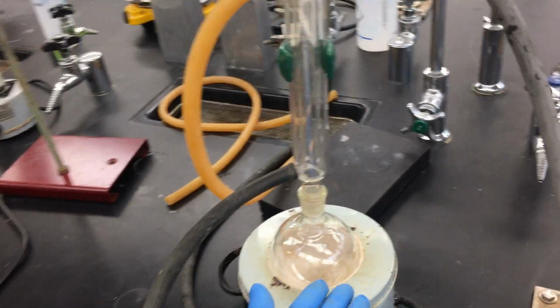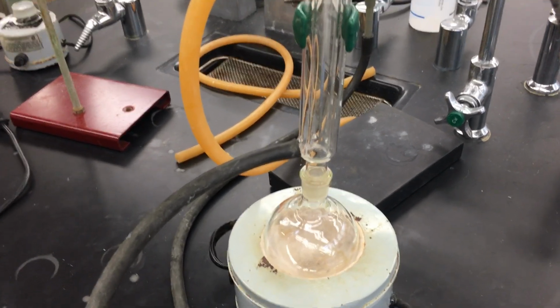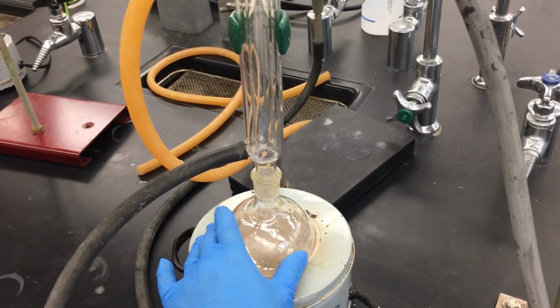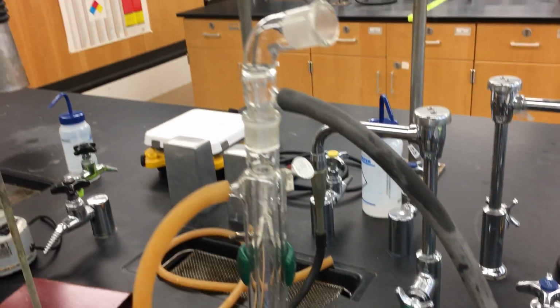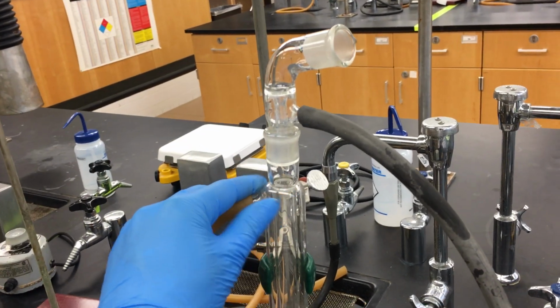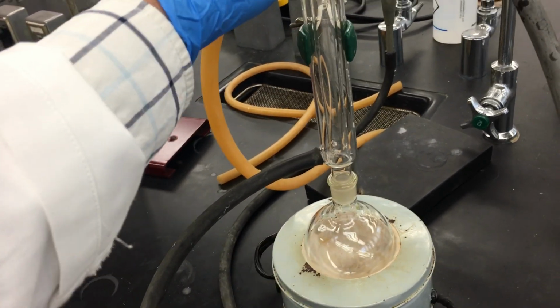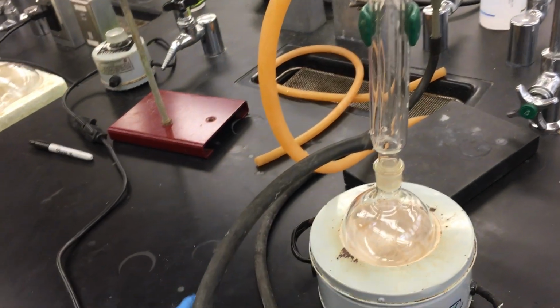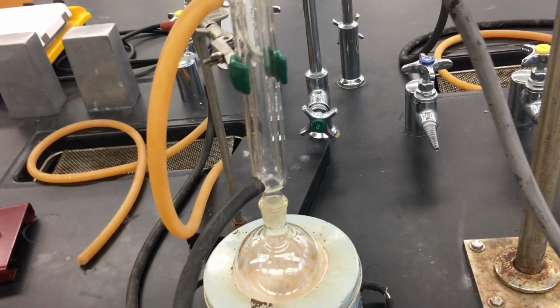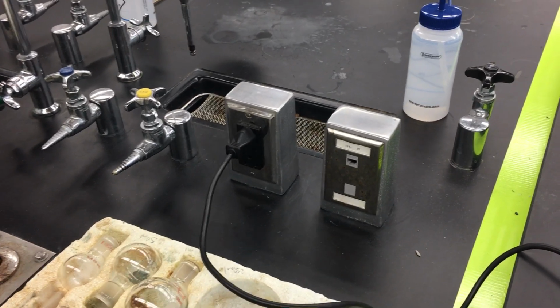So, as we are boiling our solvent and our butanol is converted to bromobutane, over time, the boiling temperature of our mixture should go down. If we were to stick a thermometer inside and see the temperature, we should see that the temperature drops as we lose butanol to the synthesis of bromobutane. So, through our refluxing, we will lower our heating rate, adjust it on the controller for the heating mantle here. That's connected to the electrical outlet.